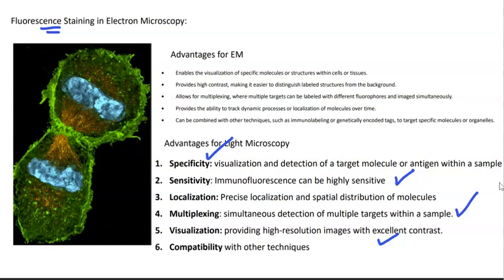And so you can see in the image here we have a cell in the process of division. We have the spindles here, the DNA aligning across the equator, and so a tremendous amount of detail can be derived from fluorescent staining techniques as well. Microscopy itself is a tremendous skill set and a major aspect of biology in which many biologists specialize in these techniques alone.